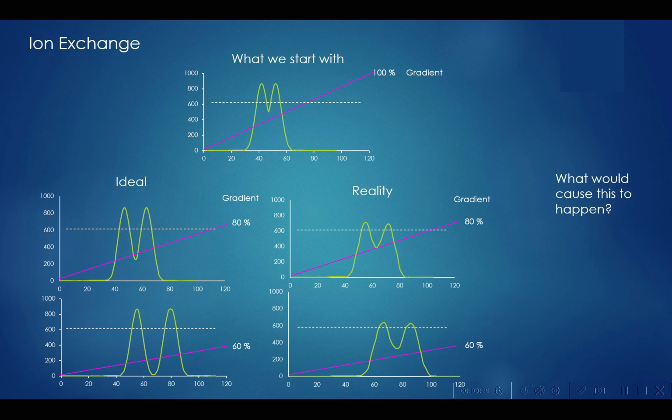The practical application of this can be shown in this idealized case that I drew here. In this example, we're sticking with ion exchange, so let's say Q still, and we start with the chromatogram on the top in the center. Here we have two peaks that aren't separated enough, and our goal is to get a clear differentiation between them so that they're effectively bimodal. Among our choices to be able to accomplish this task is to change the gradient, perhaps to make it so that the run ends at a lower concentration. I mean, it isn't our only option, but it's definitely a good place to start.